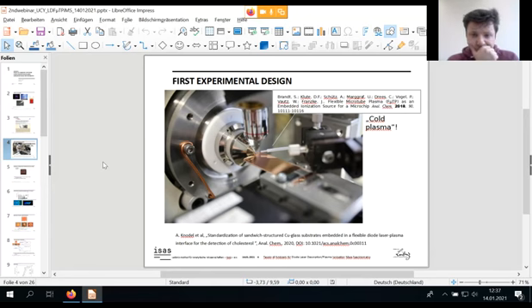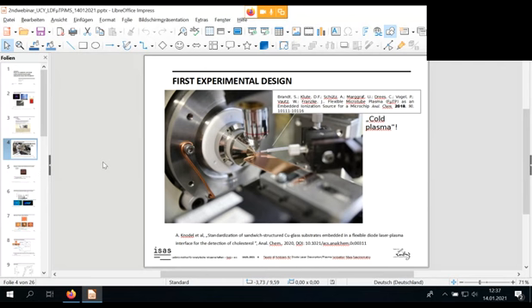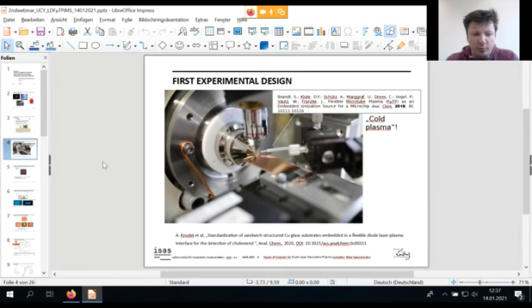And the continuous wave power, how much is it? Usually you use a laser diode controller for this purpose. I'm not quite sure what power the laser diode controller really needs. I just measured the power of the outcoming laser output and then fixed it. It would be in the range of, let's say, 500 milliwatts, and compared to the surface, the laser intensity is about 10 watts per square millimeter.